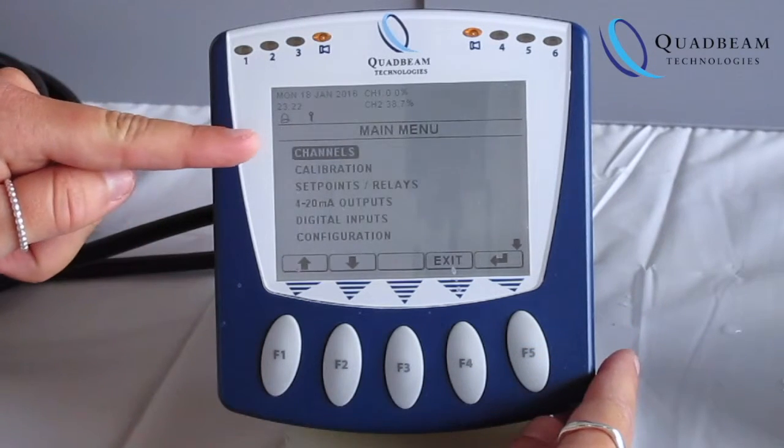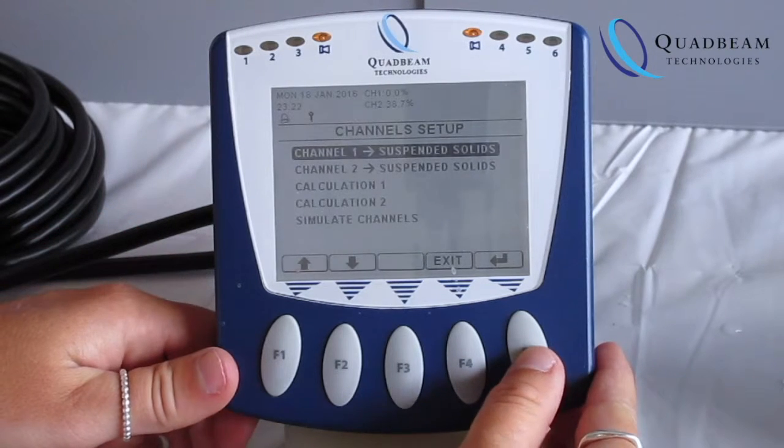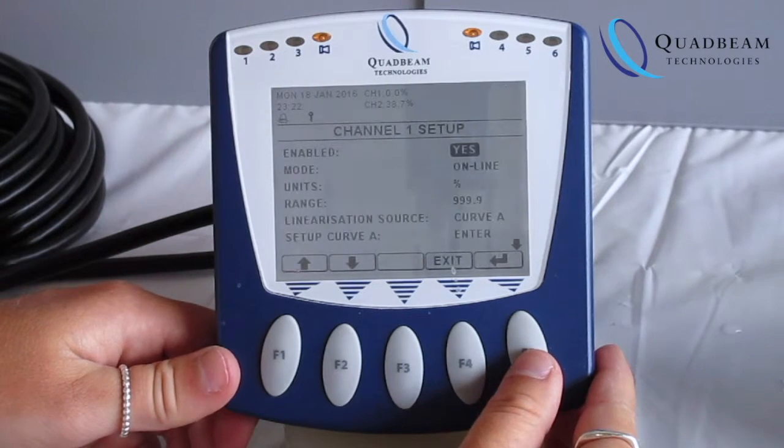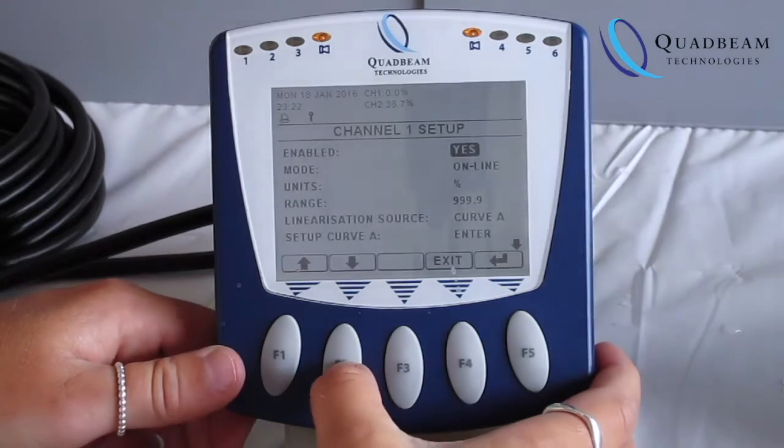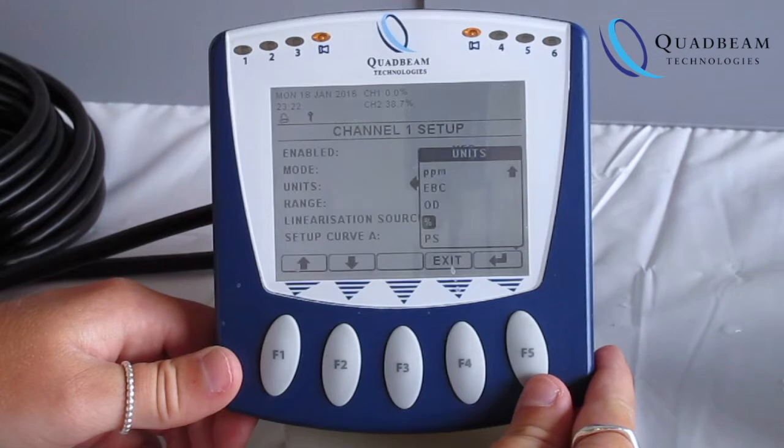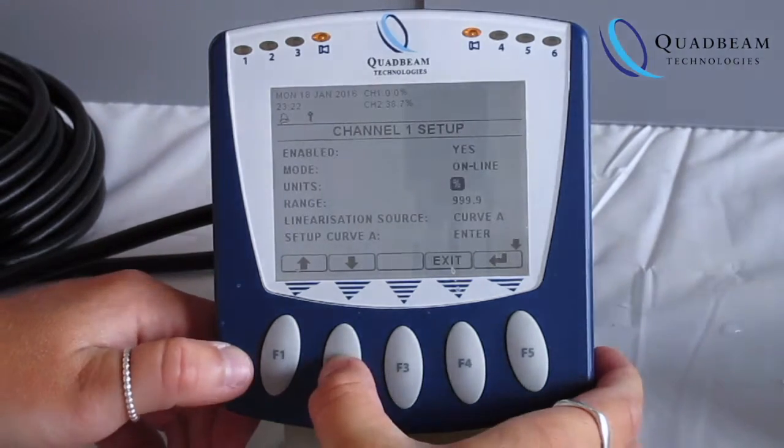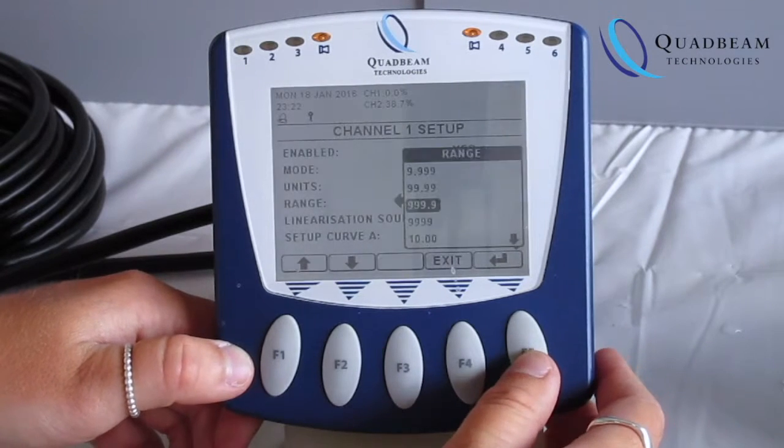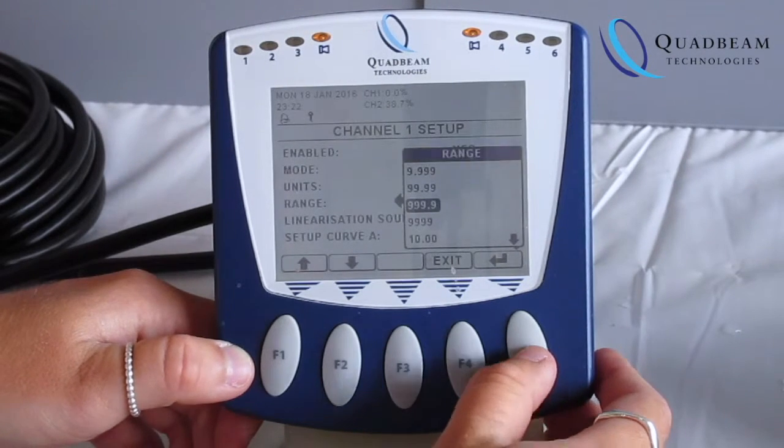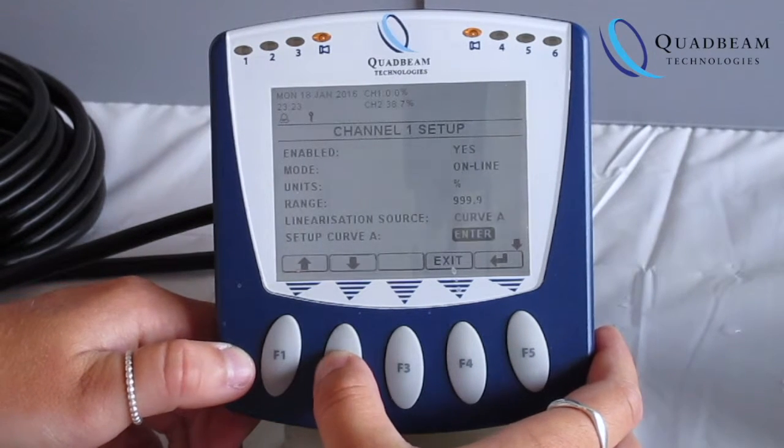First we move to channels, then we select the channel of the sensors that we're setting up and make sure it's enabled. Move down to units, insert the value of the units that we want, in this case percentage, then choose the range. In our case we're choosing 999.9 and then we move to the setup curve itself.